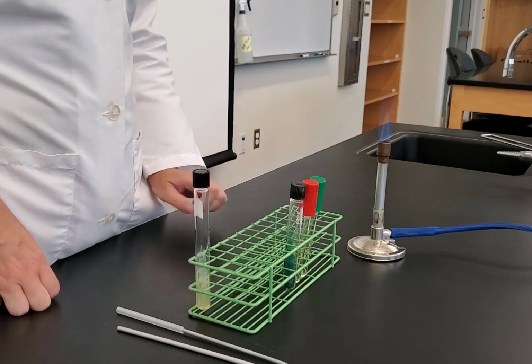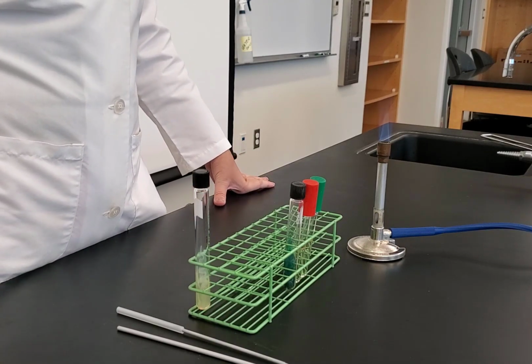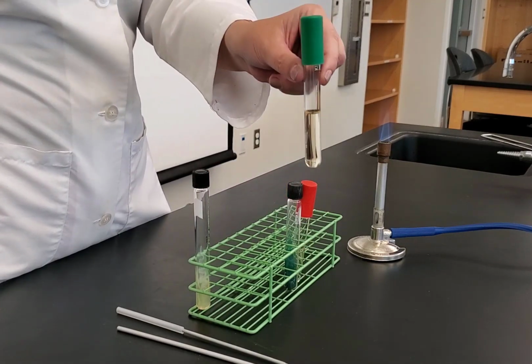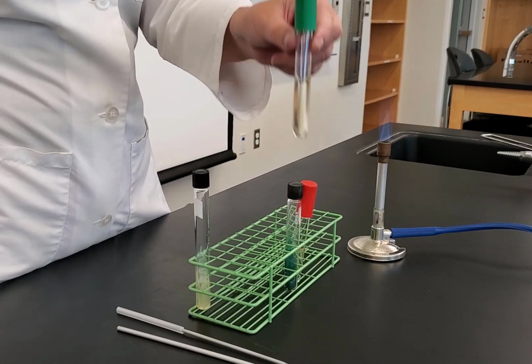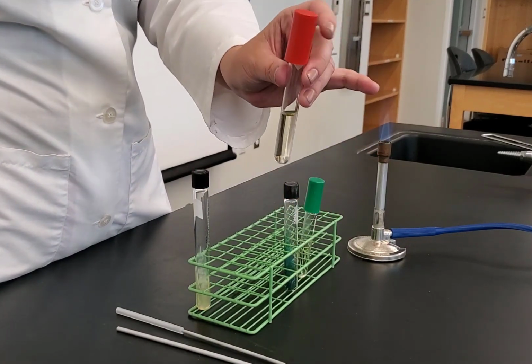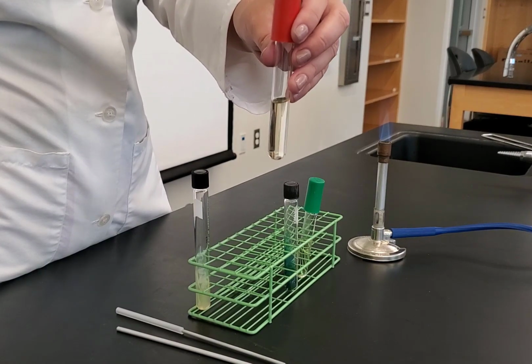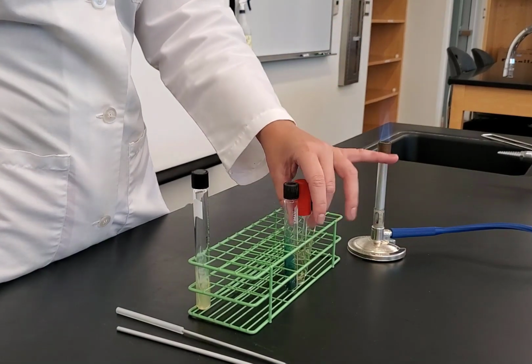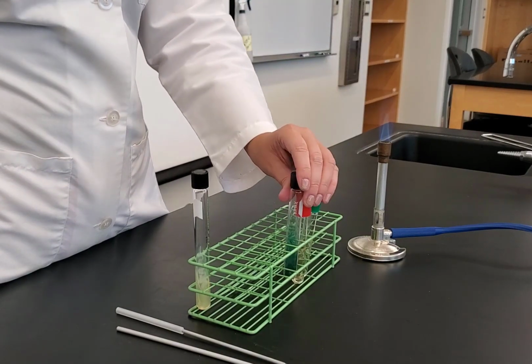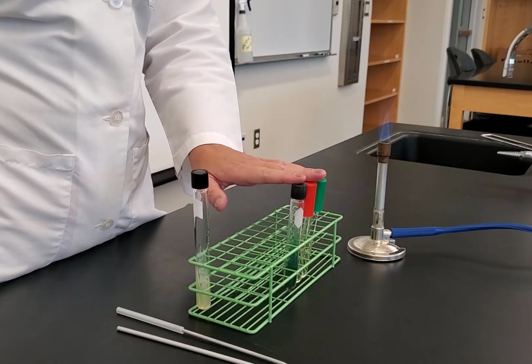So when we inoculate an IMViC, there are 3 tubes that we need to inoculate. So we have the green one, which is called a tryptophan broth. Again, that's going to be used for the indole test. The MR and VP are both in this MRVP broth. So this is both in one. And then we have our citrate, which is our slant. So when we do this, we would have 3 tubes per organism.